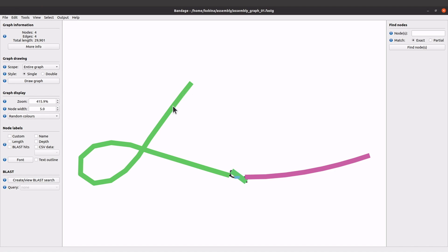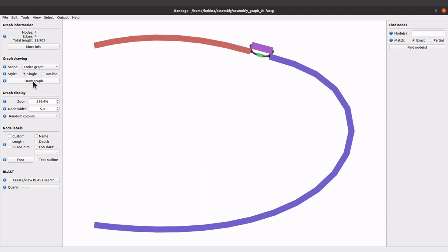When you click Draw Graph your graph will be displayed. Here we have our contigs — we have a contig here, we also have a contig here, and we also have some contigs here. With the assembly graph you can generate the same graph in different colors and different styles. Just click on Draw Graph again and different plots will be generated.